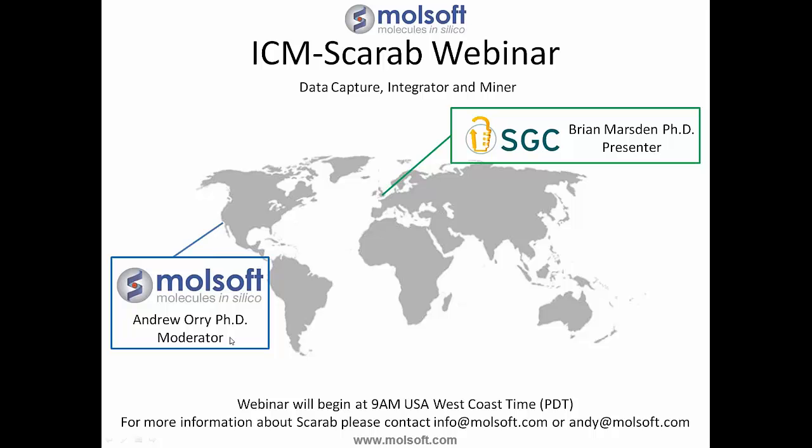Today's webinar is about a new product in MolSoft's suite of software called Scarab. It was developed in collaboration between MolSoft and the Structural Genomics Consortium in Oxford in the UK. Our speaker today is Brian Marsden, who is Head of Informatics Research at the SGC and helped lead the development of this software.